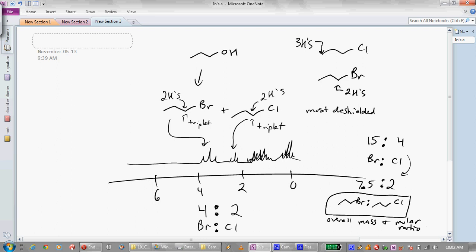Using that information, you've now got to a situation where you're in the exact same boat as pre-lab question 3, which hopefully you solved on your own. If not, hopefully you at least understand it. And if so, you should be out of the lab in no time. If not, well, good luck.